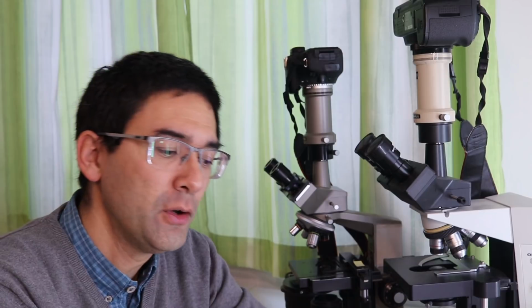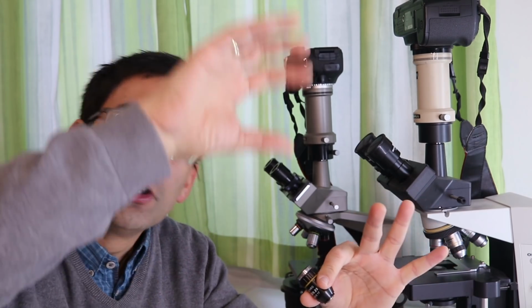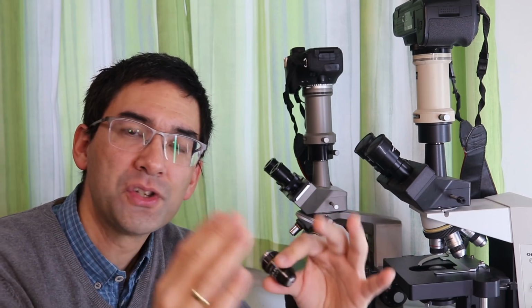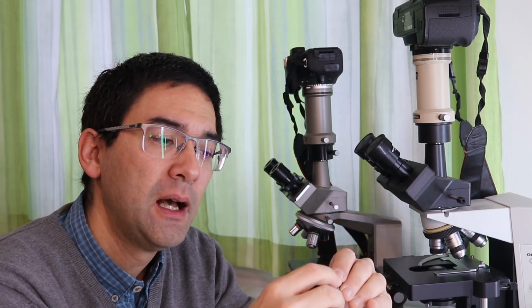However, those wide field eyepieces are of course more expensive, and if the objective itself is not of high quality, then because you see more, the sides could be a little bit blurrier than in a narrow field eyepiece, because the further you go away from the center, the blurrier the image becomes. These are so-called lens errors and aberrations.